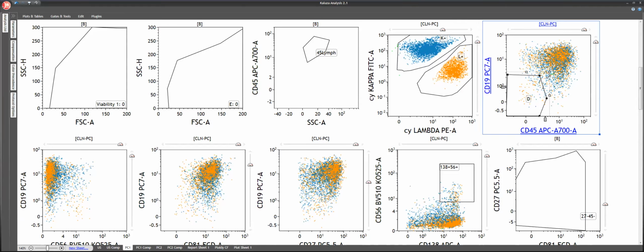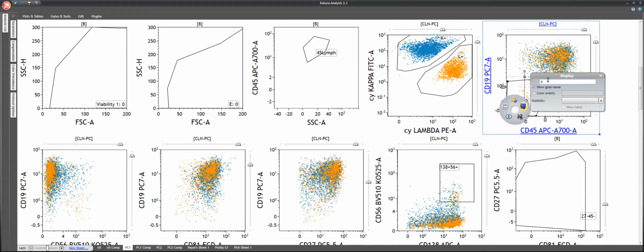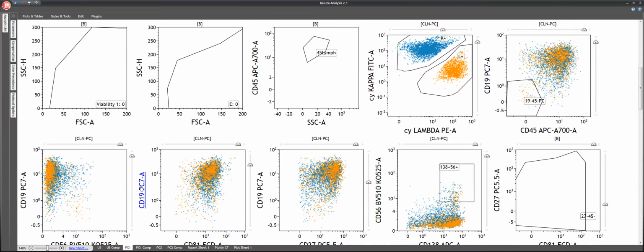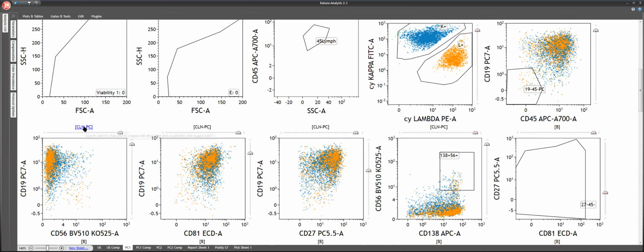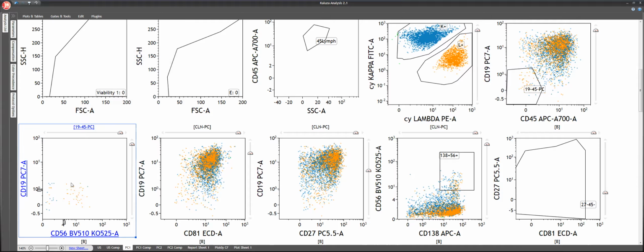So these are the CD19 negative, CD45 negative cells, and we can label them CD19 negative, CD45 negative plasma cells, CD19 negative, CD45 negative disease. Okay, and then we can try with other markers. Now let's try CD19 negative, CD45 negative, and we have CD56 positive, predominantly plasma cells, which appear all lambda because they are coming from lambda.